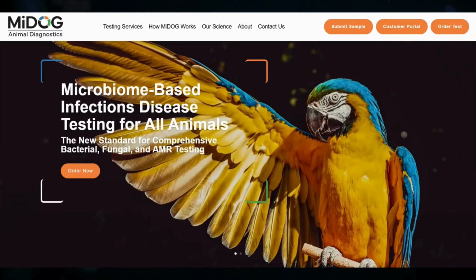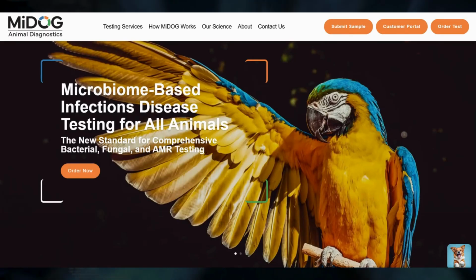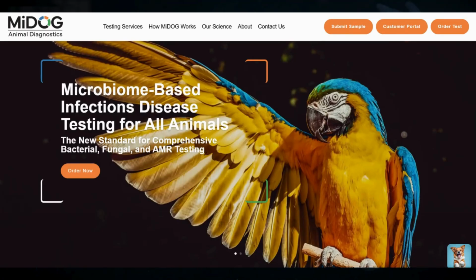Hello, and welcome to the MiDOG Portal walkthrough. In this video, we'll go over how to access your MiDOG lab portal and where to find records such as your results, order history, and patient information.